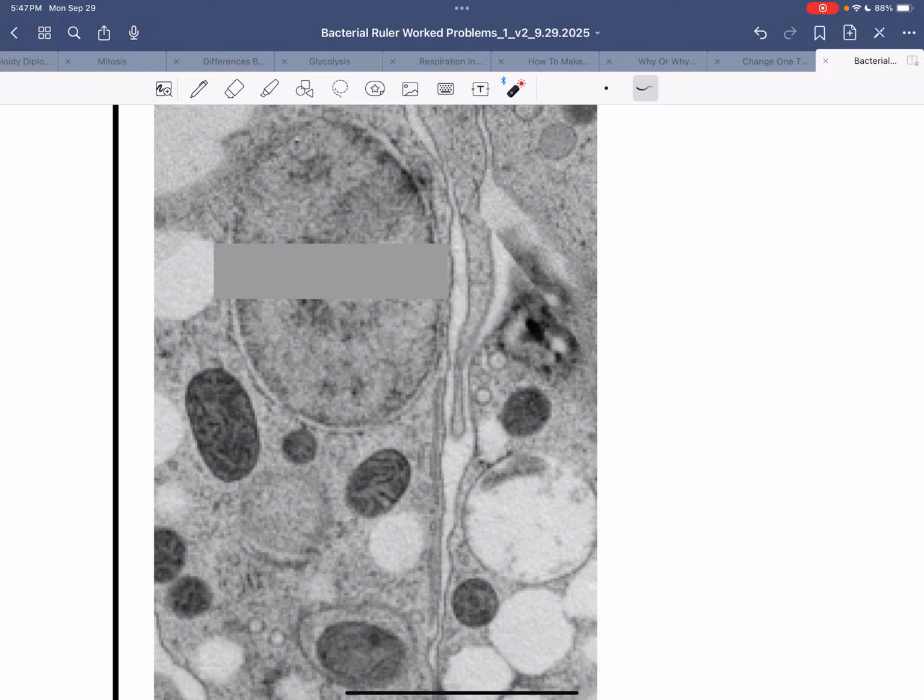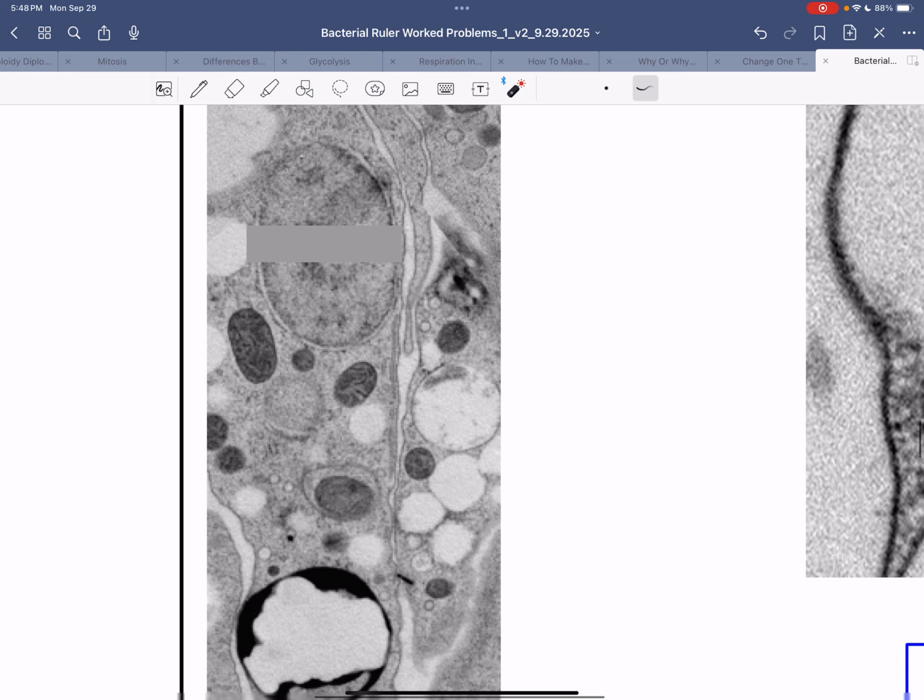This is a nucleus. You can, in this case, see the double membrane. Here's the inner nuclear envelope, nuclear membrane, the outer together making up the nuclear envelope. And a clue that it's the membrane is that some parts are darker and some parts are lighter, and that corresponds to how tightly the DNA is packed. Heterochromatin and euchromatin, showing this mottled pattern of darker and lighter parts there.